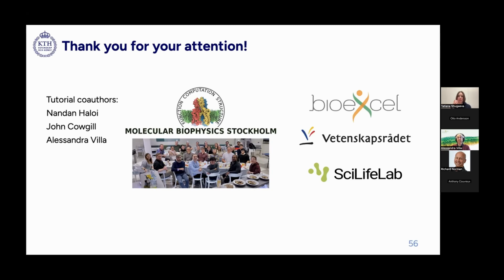But in case you want to generate artificial density around your atoms, there is a Chimera command for that, maybe molmap, if I remember correctly, but you can look this up, and you can generate densities in Chimera, for example. Yeah. Thank you very much, Tatiana.